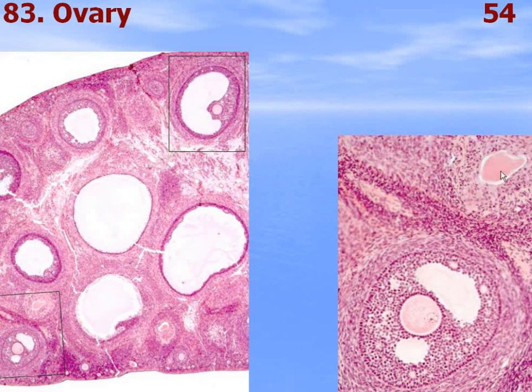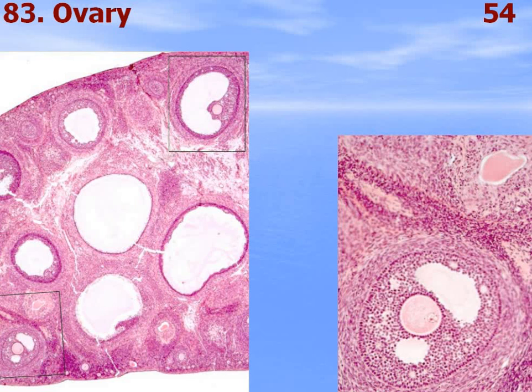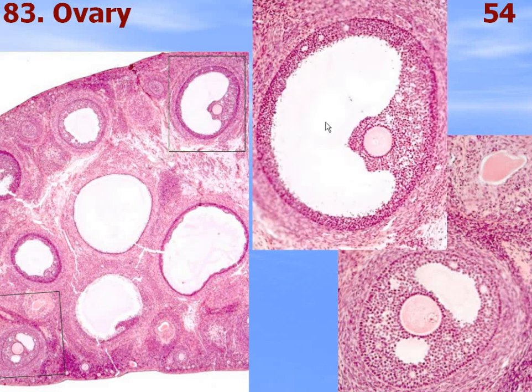This is an atretic follicle with a folded zona pellucida of a dead oocyte, and around it the remnants of follicular cells and thecal cells. Corpus albicans is dense irregular connective tissue that forms on the place of a corpus luteum which died by apoptosis. Tertiary follicle.